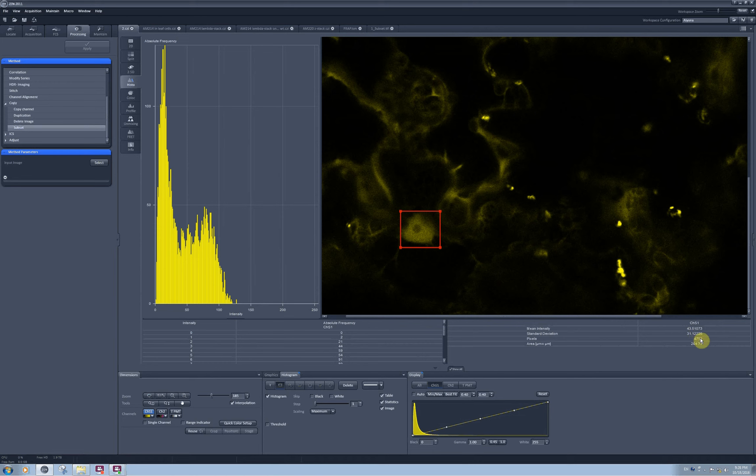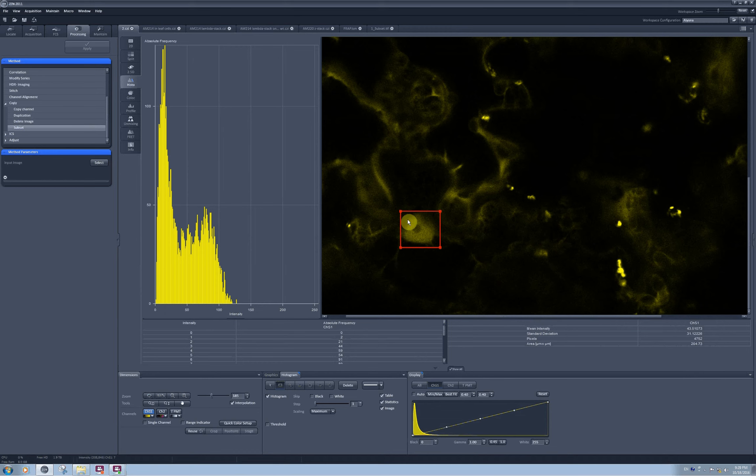One of the reasons why the standard deviation is so high is that rectangle actually is not the best selection tool to select the round nucleus. All these black pixels are included which don't belong to nucleus at all.